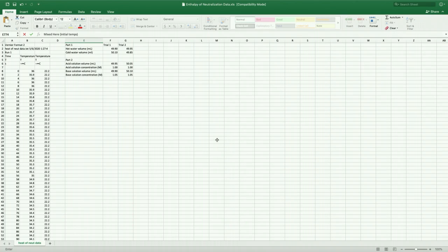Hopefully, this data table sums things up nicely enough that it shouldn't be too bad. Probably what you'll see is that using this data shouldn't be too bad, but it is going to be a significant number of calculations to get to the end data you're trying to eventually find. But that is pretty much everything I have for this week.